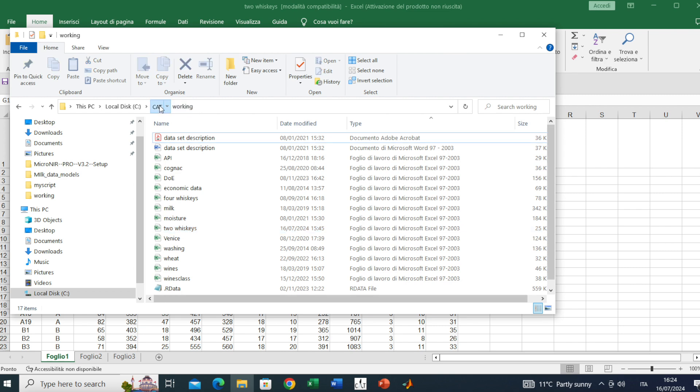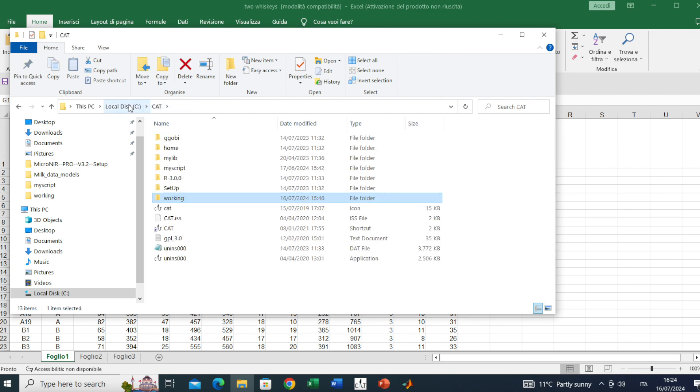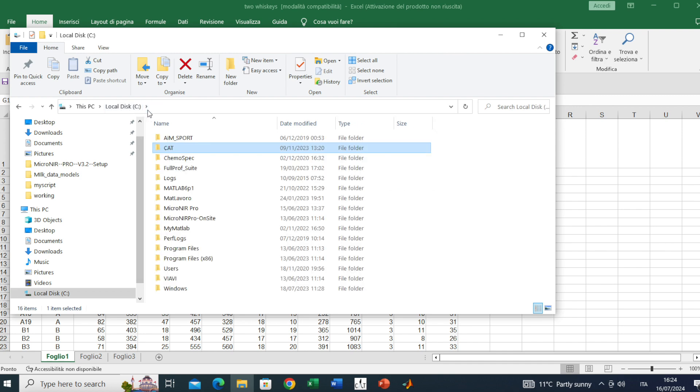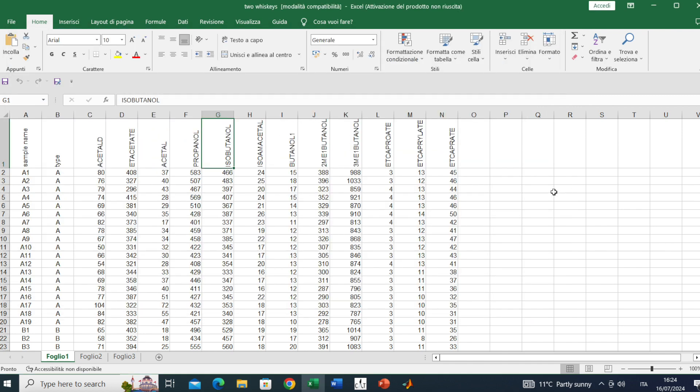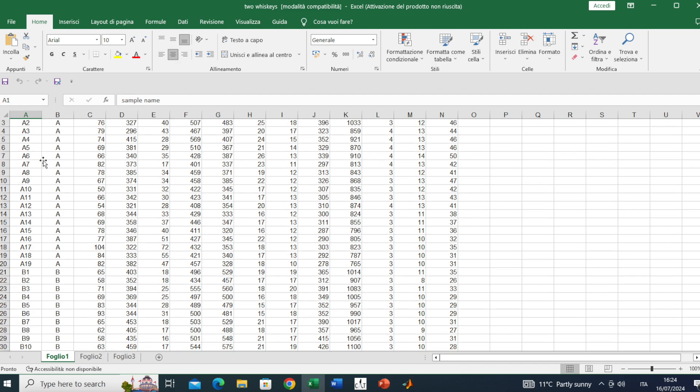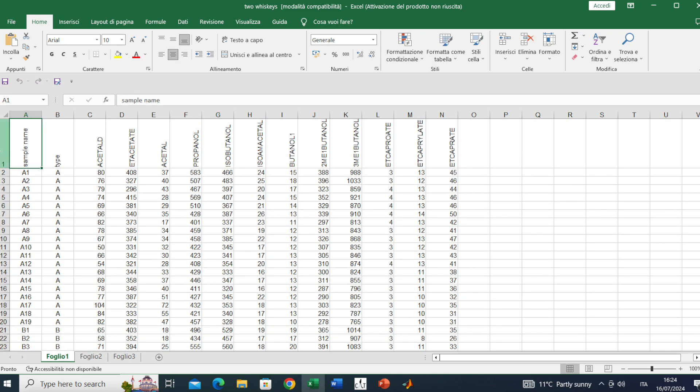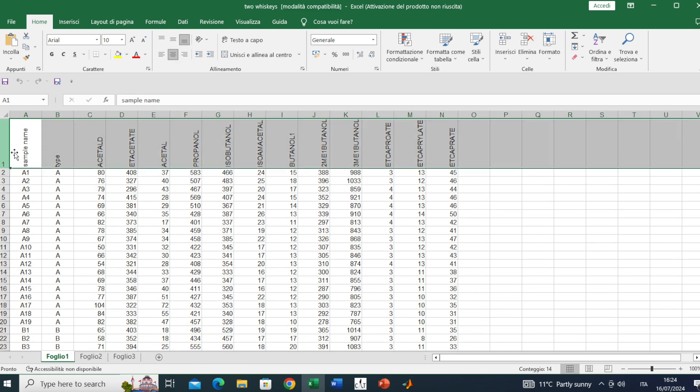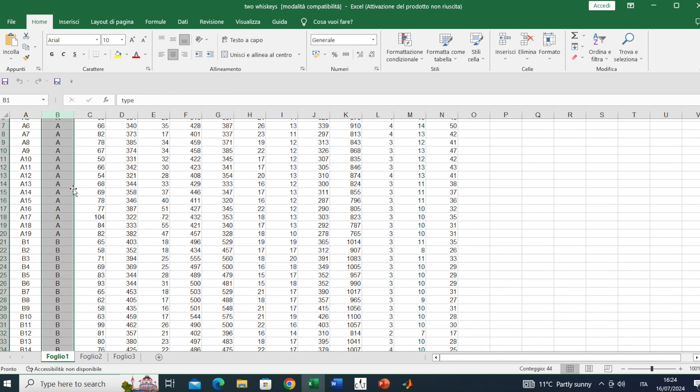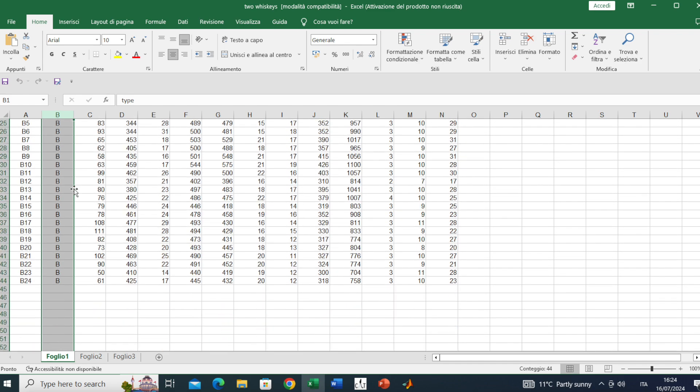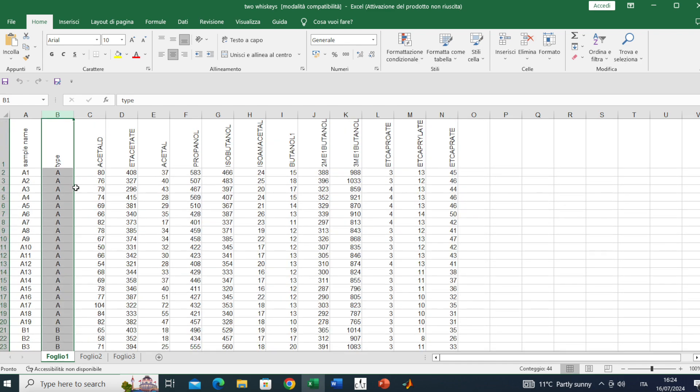I have it already opened. As you can see, we have 43 samples. The first row is the header while the first column is the sample name. The second column is telling the type of whiskey. In this case we have two types, A and B.